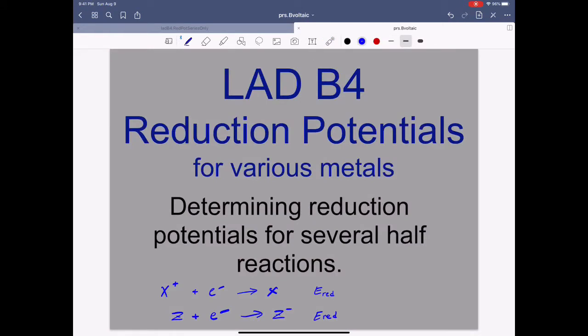In Lab B4, called Reduction Potentials or Voltaic Cell, in which we will measure potentials for the cell, we're going to determine reduction potentials for several half-reactions.